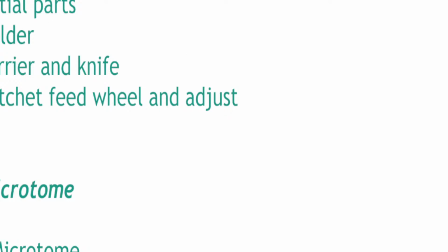Yes. Okay, ano yung pawl, sir, tsaka yung ratchet feed wheel? Ano yan? Ratchet. Ano yan? Yan ba yung mga babae na palainom? Tapos nangaaway? Yan ba yung mga ratchet na yun? Ganun ba yung ibig mong sabihin, sir? Hindi. Yung ratchet feed wheel, siya yung nagpapalapit sa ano? Nagpapalapit. Yun yung wheel na iniikot mo para lumapit sa blade yung section.